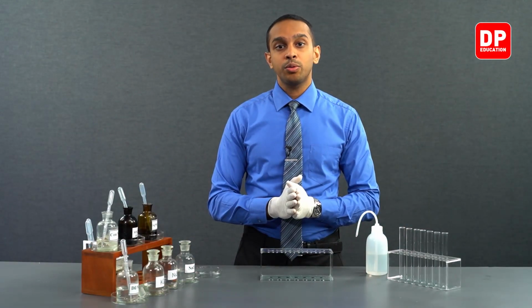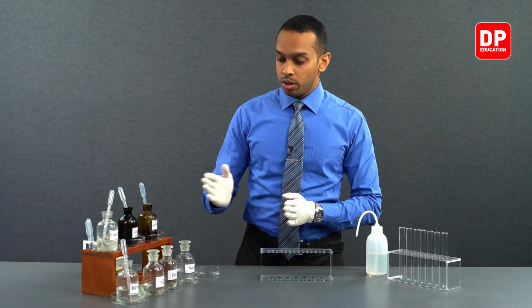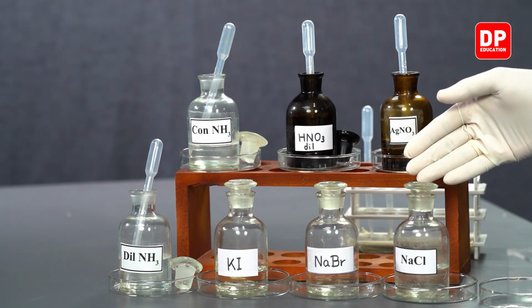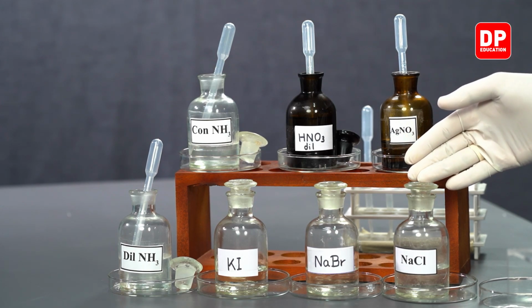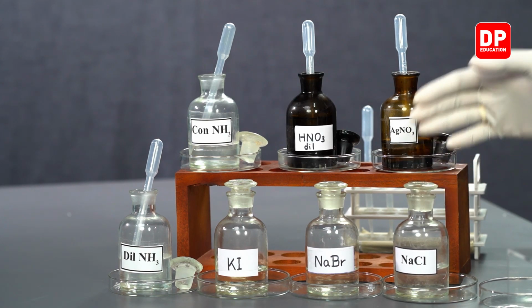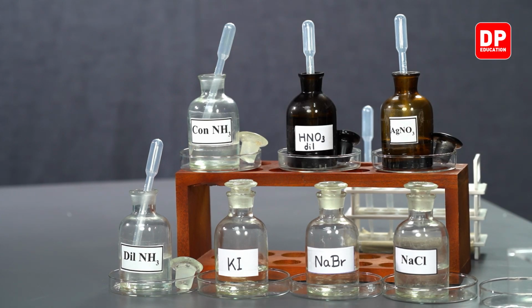First, we'll be starting with how halide ions react with silver nitrate. Initially, we'll be taking sodium chloride, which will bring chloride ions into the medium, and we'll be reacting it with silver nitrate and observing the changes that take place.